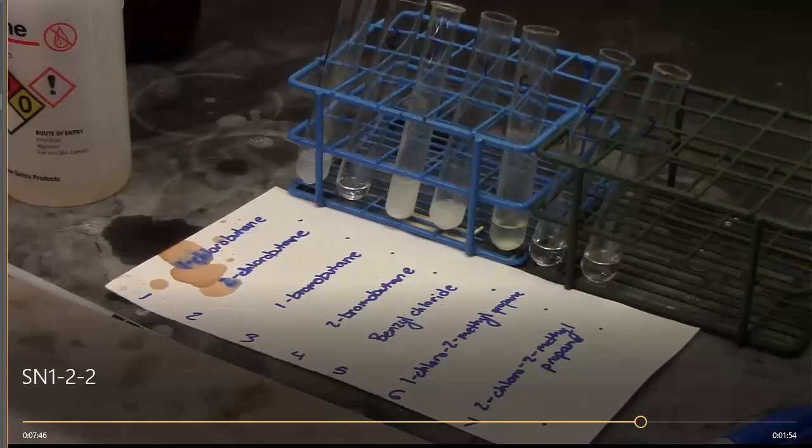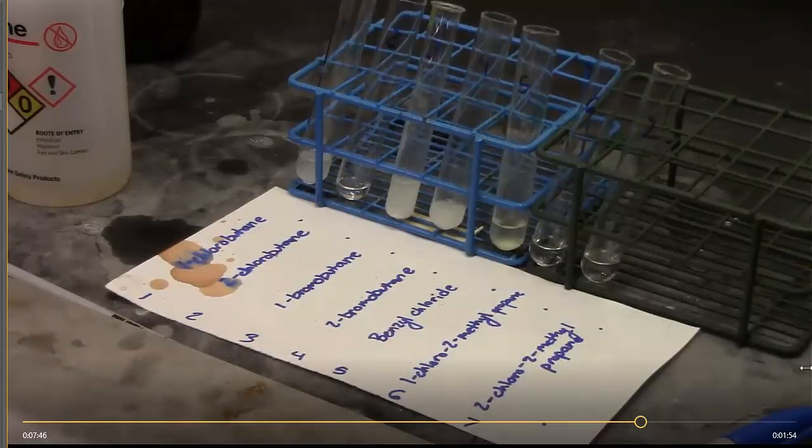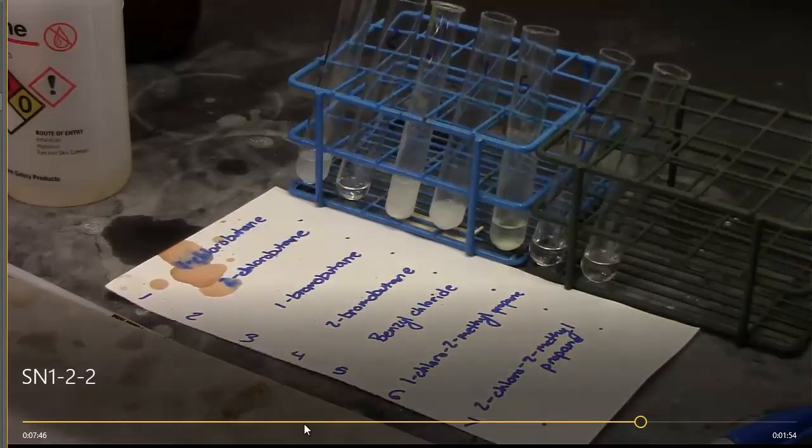Looking at our final products here, it looks like our 2-bromobutane, which did have some cloudiness in it, ended up with quite a bit of precipitate. Again, remember we didn't have our 1-bromobutane or benzyl chloride in the hot water bath. Those already went. We had plenty of precipitate to call that an end time. And again, for 1-bromobutane, we were about 10 seconds, benzyl chloride about 60 seconds. Our 2-bromobutane was just slightly cloudy before we put it in. Quite a bit of precipitate formed in that, though.